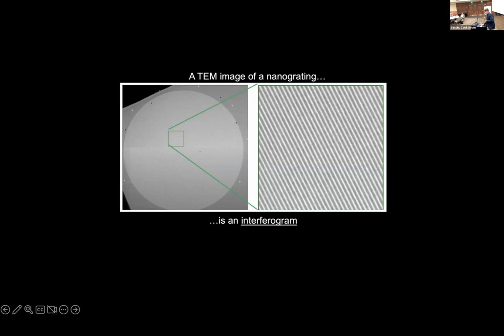Okay, well, here's an image of our grating. Zoom in, here's grating bars. Now, I'll submit that whenever you have an imaging system that's looking at a periodic object, you've made an interferometer. So the spatial illumination is now modulated. You've created diffraction orders at some intermediate plane, and then your imaging lens is taking those different Fourier components and overlapping them to interfere to form the image.